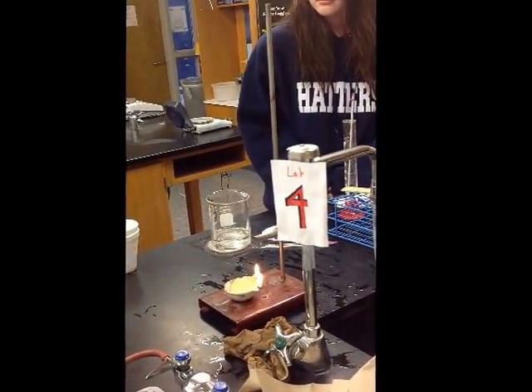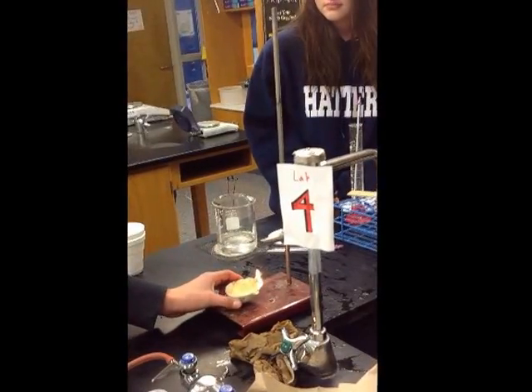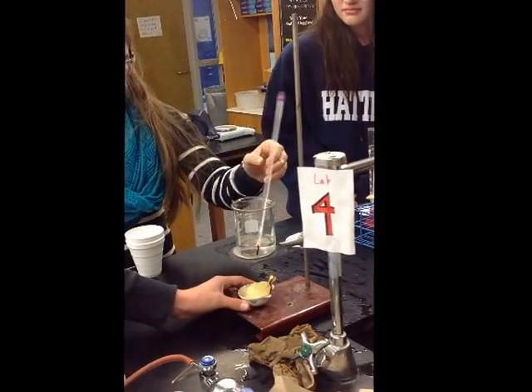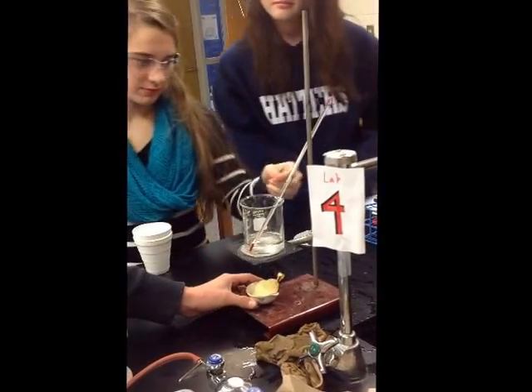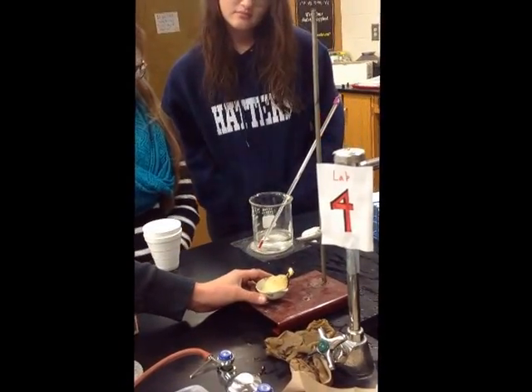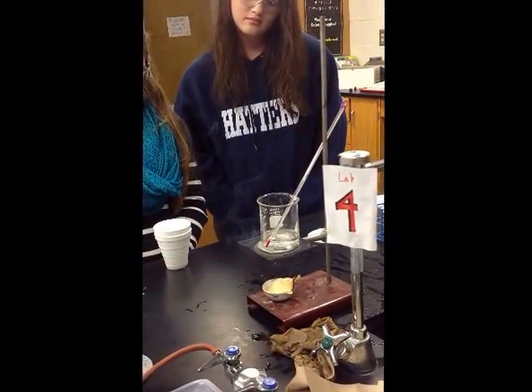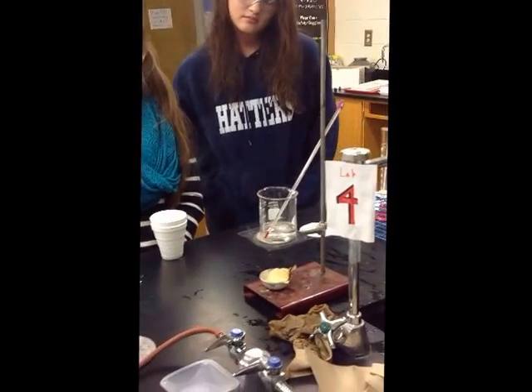Lit. Nice job. Now, I don't know how they're going to find out how much the temperature rises because I don't see the thermometer up there. Ah, there we go. I think the direction said to light from the bottom of the chip, and that's one reason it will stay lit if it's lit underneath. So we can try again.